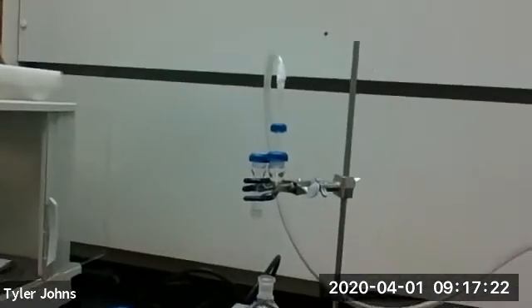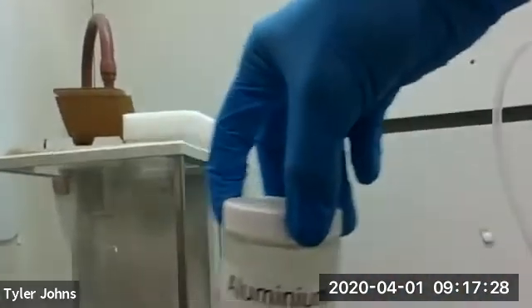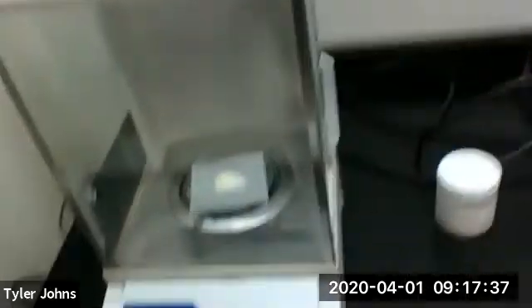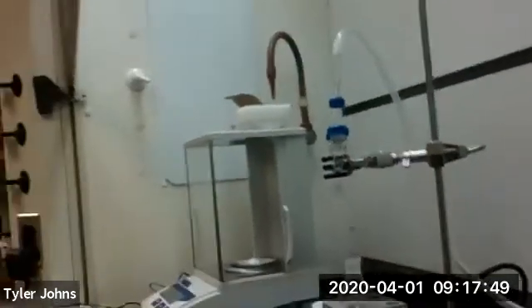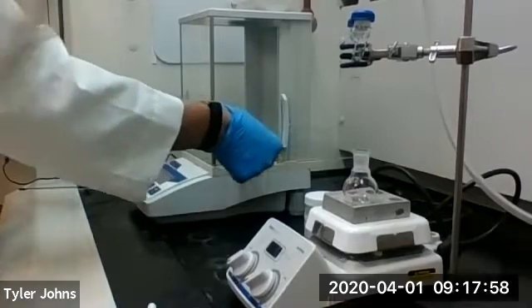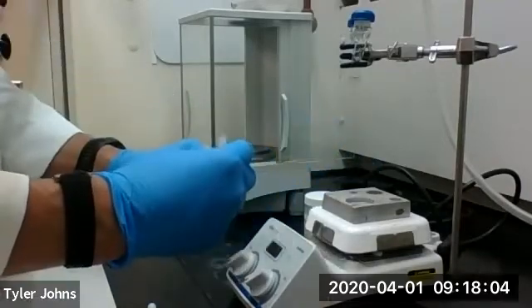We're next going to weigh out about 0.8 grams of aluminum chloride. I've already gone ahead and weighed out 0.8 grams of aluminum chloride. We're going to take our 0.8 grams of aluminum chloride and add it to our 20 mL round bottom flask.